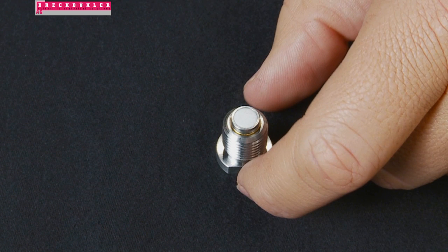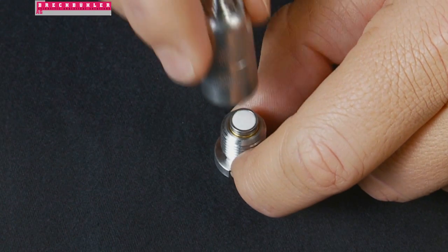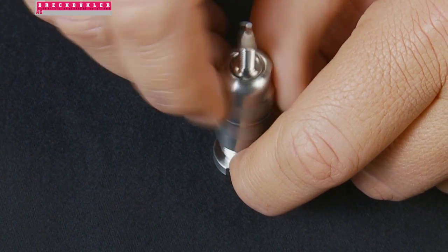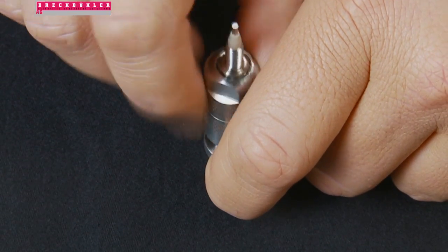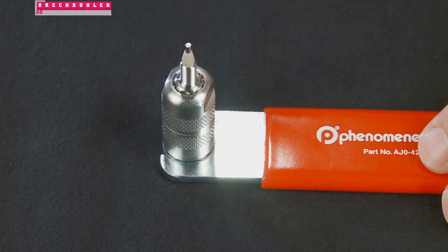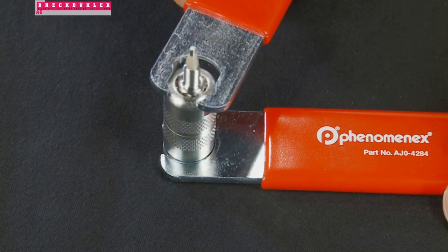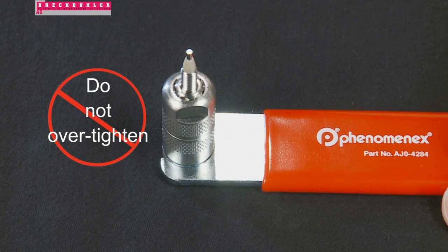Hold the male unit with the cartridge in place in the upright position. Screw the female unit back onto the male unit and hand-tighten to complete the assembly. With the wrenches supplied in your kit, continue to tighten the assembly up to a quarter turn to seal the cartridge inside the holder. Do not over-tighten, as this may cause cartridge and assembly failure.